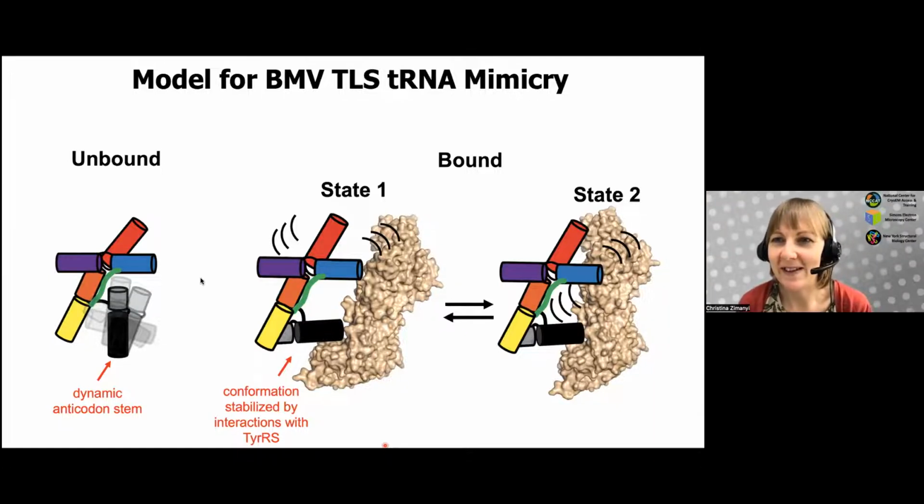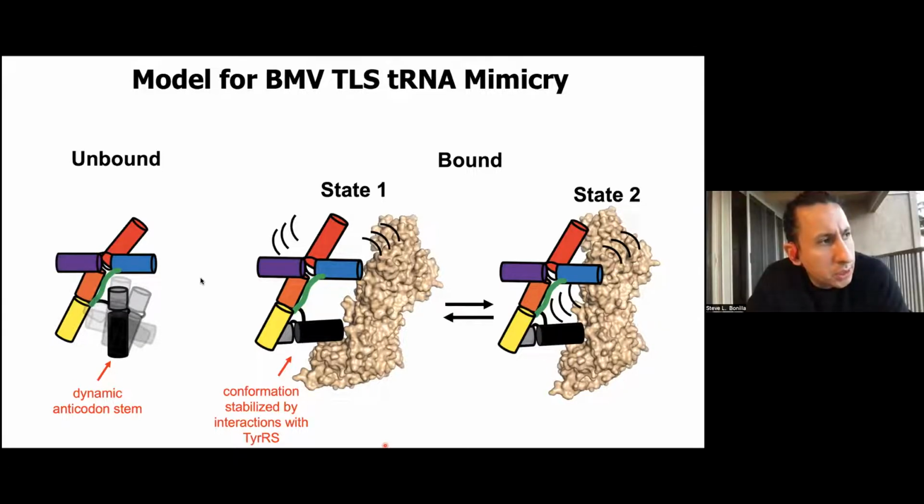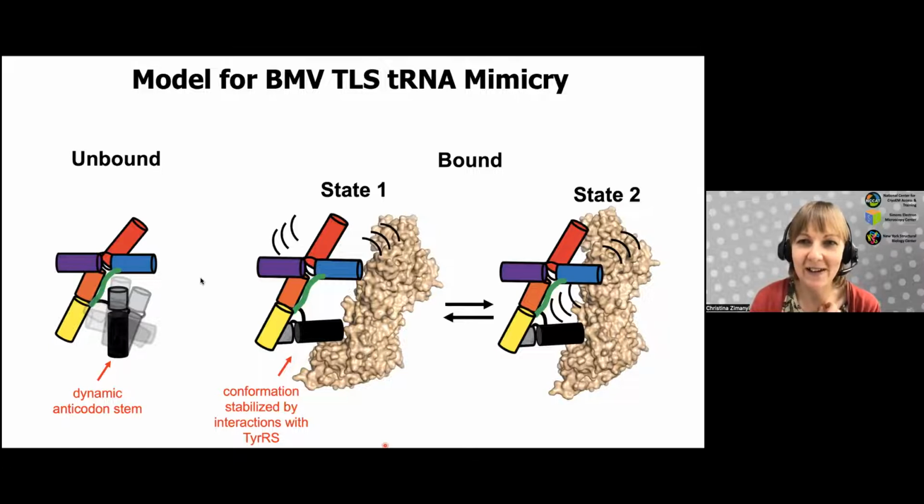A couple more questions have filtered in. Chiara Rapsidara asked, did you try any other ways to improve the orientation distribution of the particles, or did you just do tilted collection? Yeah, I went straight into tilted collection. From talking to people, I think the best way to approach this would be to try to fix those preferred orientations in some biochemical way, or by changing the solution conditions before you go into tilting the grid. But that's how we did it. We just went straight and tilted.